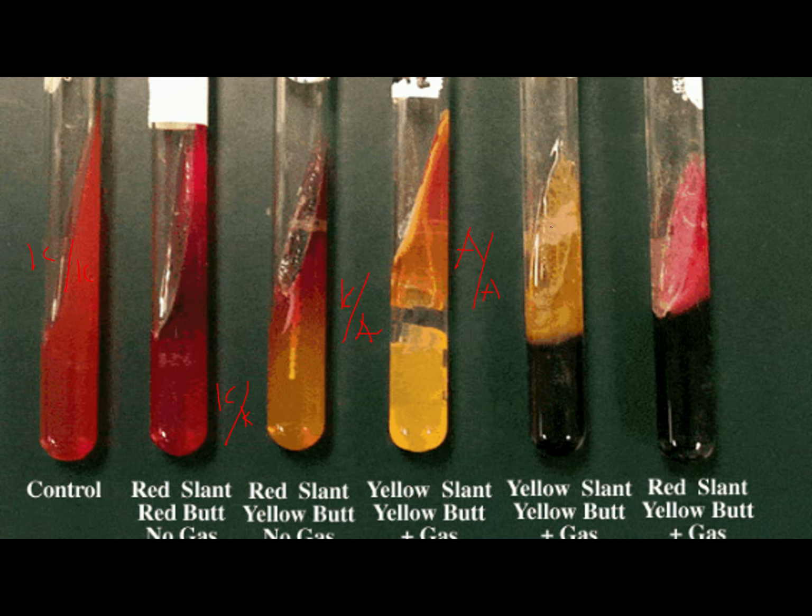Now here you would have a black precipitate or a blackening of the media signifying hydrogen sulfide production. So when this happens, class, you would always report this as acidic or yellow. You may be wondering, sir, why yellow? That's the standard rule.